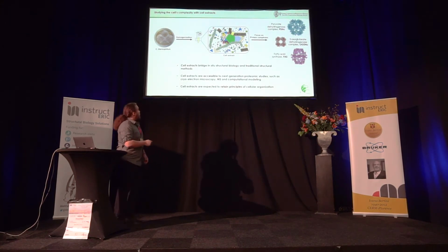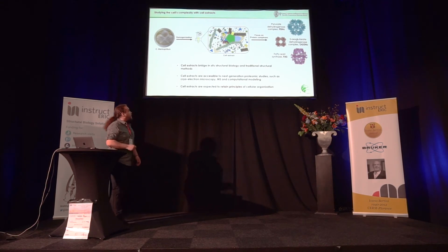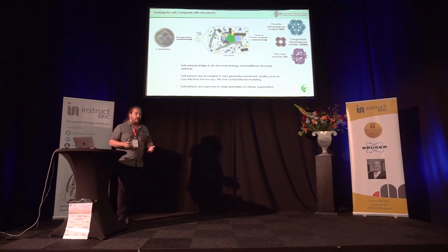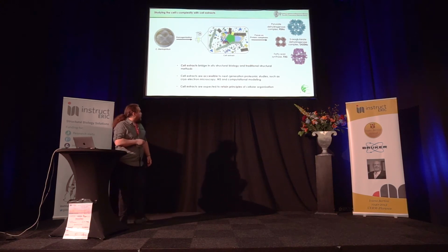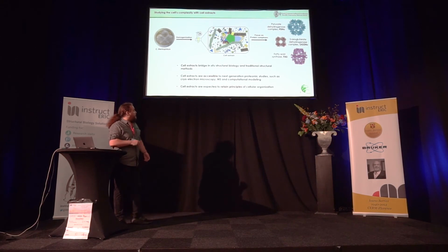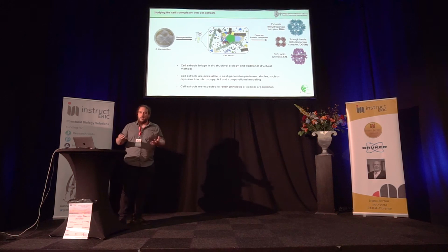In our lab, we study cell extracts because we believe that they bridge in situ structural biology with traditional structural methods, and we can employ with them all kinds of modern biochemical and structural techniques such as Cryo-EM, mass spectrometry, and of course a lot of computational modeling. Also, we expect cell extracts to retain principles of cellular organization. After we have our cell extracts, we mostly focus on megadalton-range protein complexes.